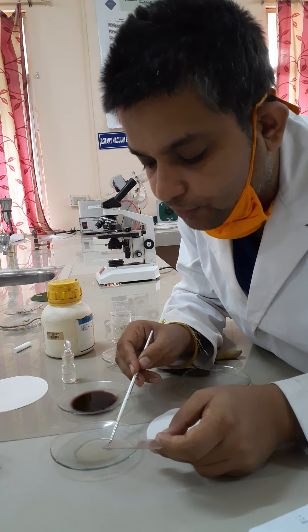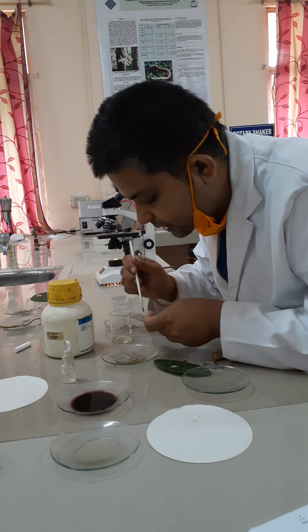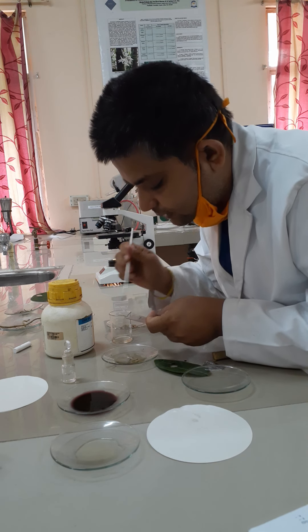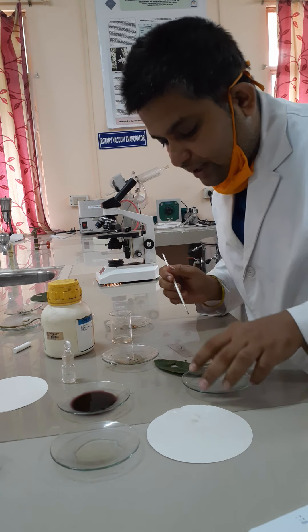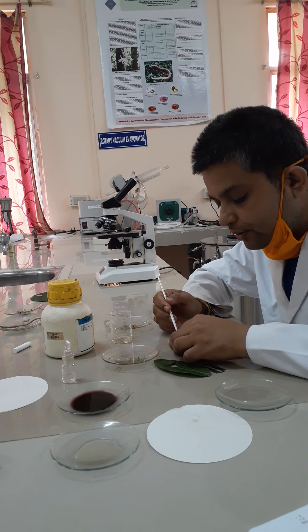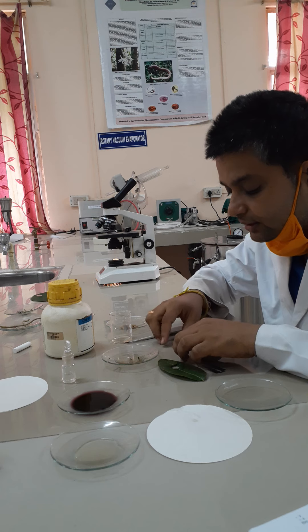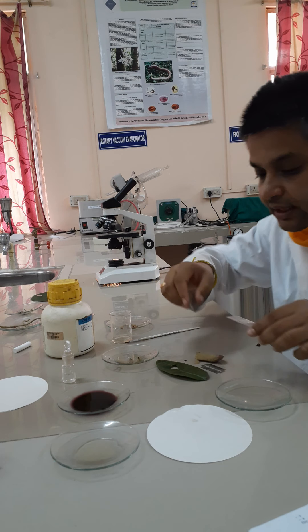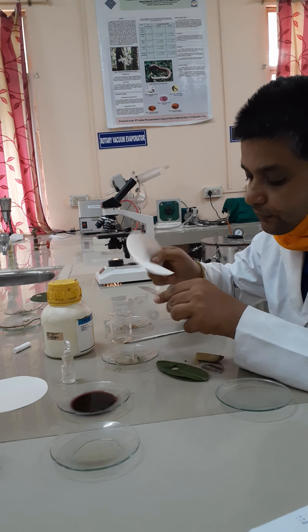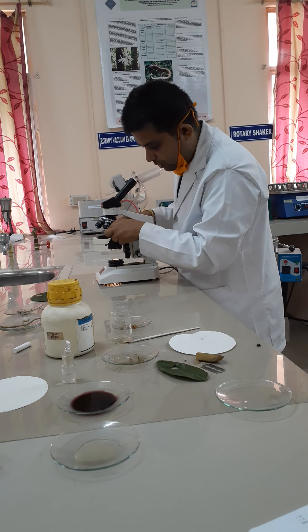Slowly, with the help of a brush, take the section out. Put some glycerin over it so that your slide does not get dried. Place it on the slide, add a coverslip over it — this completes the preparation of the slide. Wipe out the excess reagents and place it under the microscope for proper observation.